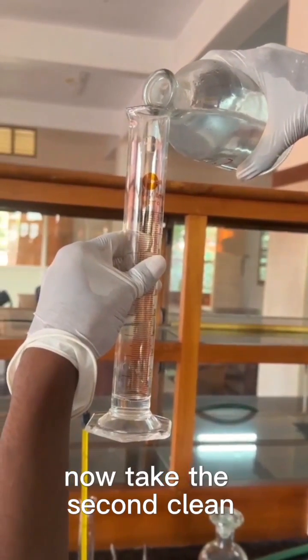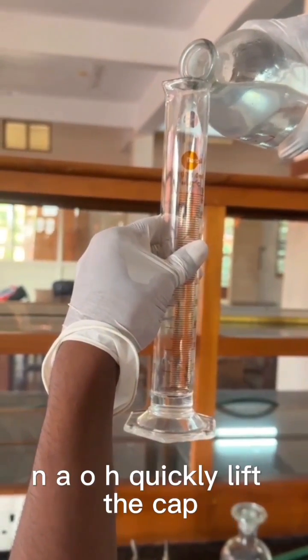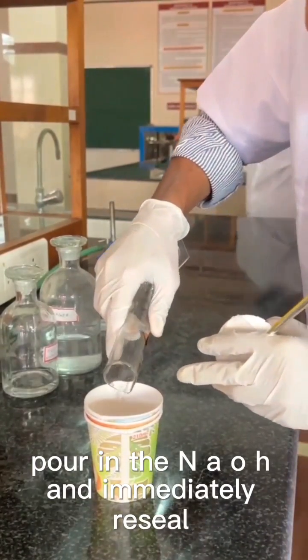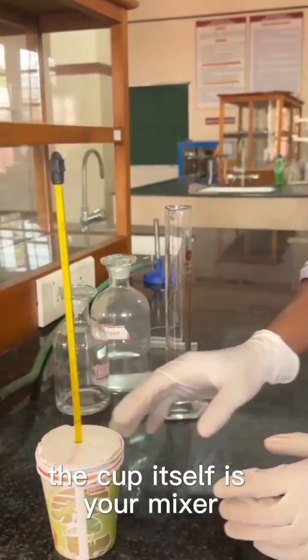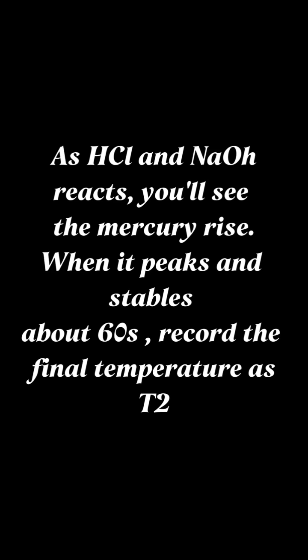Now take the second clean graduated cylinder and measure 10 milliliters of 1.0 M NaOH. Quickly lift the cap, pour in the NaOH and immediately reseal. Gently swirl the cup. No stirring rod needed, the cup itself is your mixer. Watch the thermometer. As HCl and NaOH react, you'll see the mercury rise. When it peaks and stabilizes, about 60 seconds, record the final temperature T2.